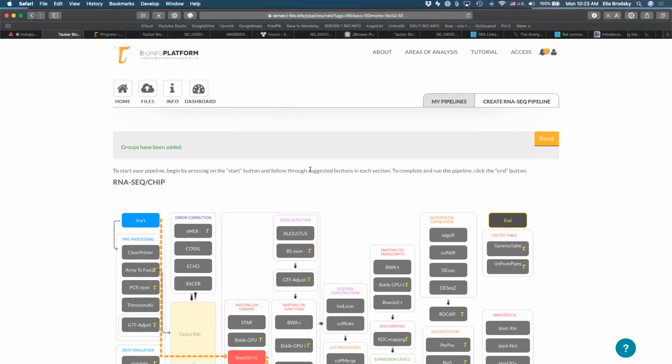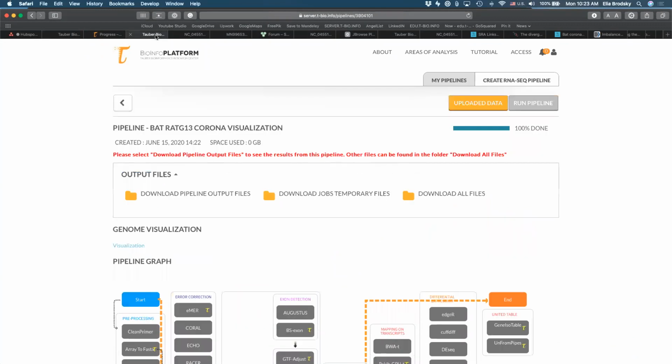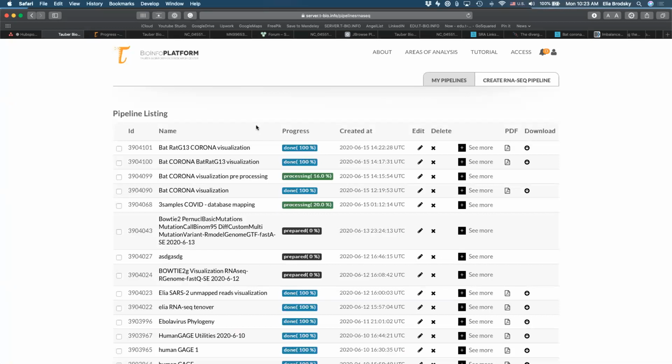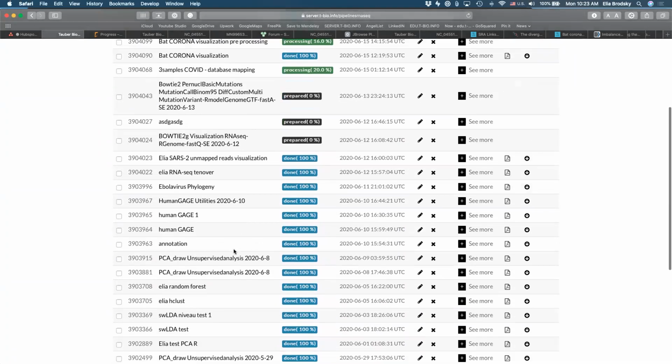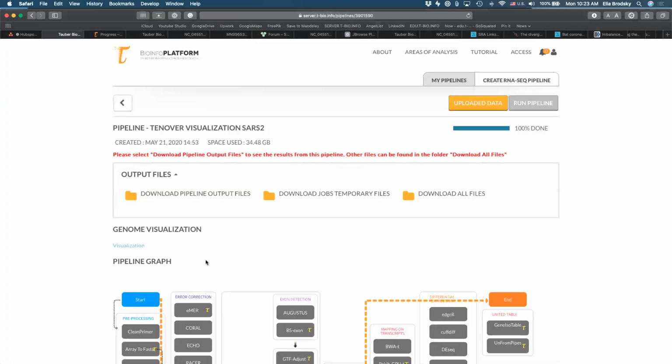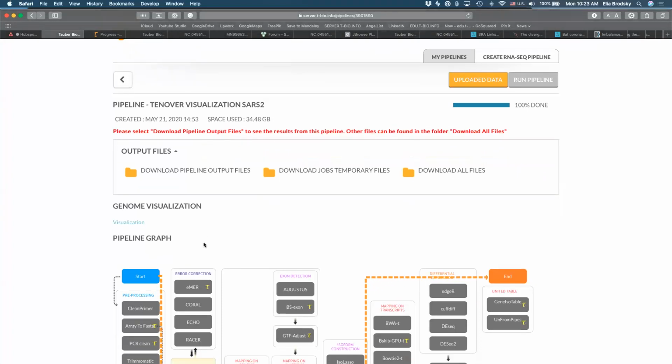Okay, so has anyone been able to successfully visualize this and see the results? Let's take a look at what the results would look like. So if you had successfully done that, please type in yes. Okay, so no one has been able to successfully do this yet. So if you would like to follow along in today's session, I'm sure that pretty soon you will have the results just like I will show you today.